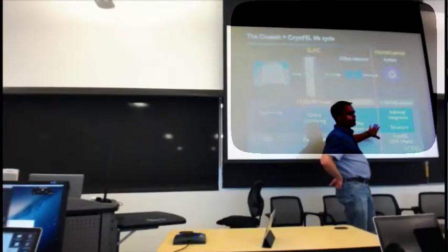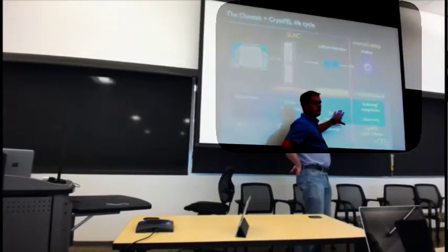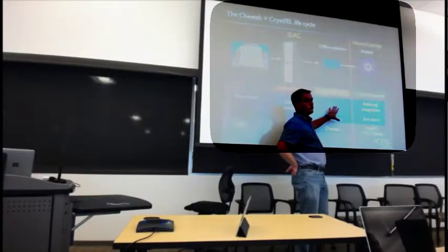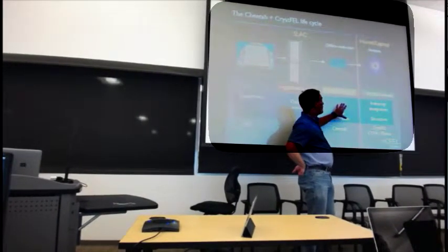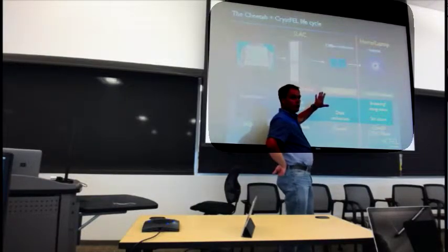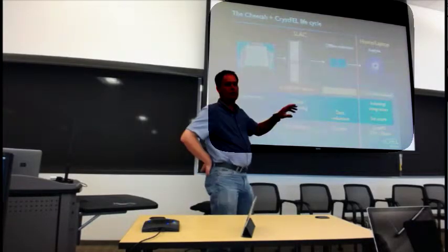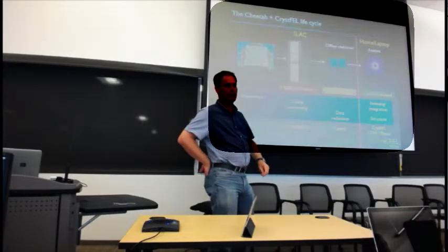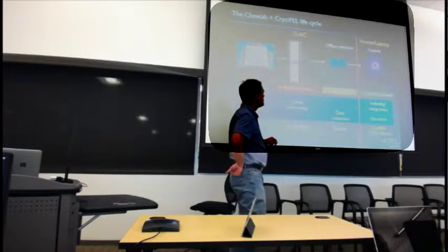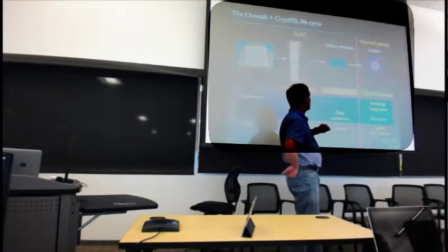So you can do your data reduction. What we usually do is our data reduction before we come to the end of the experiment even, or if we go back to the data, we do all that within the SLAC framework. There was a time early on when the frameworks weren't as good as they are now, and we actually took all of the hundreds of terabytes home and worked on it at home. These days things are good enough at SLAC, including pulling old experiments from tape.